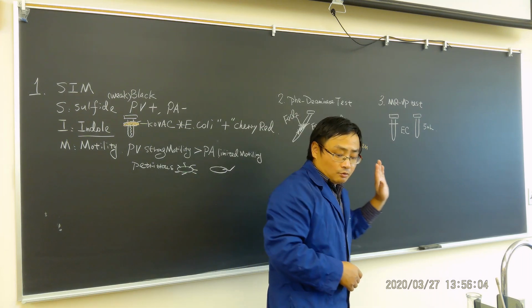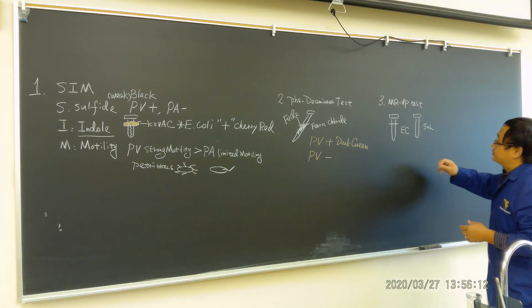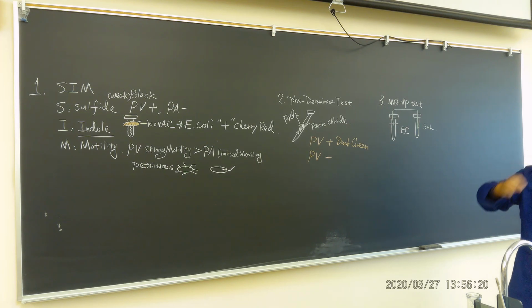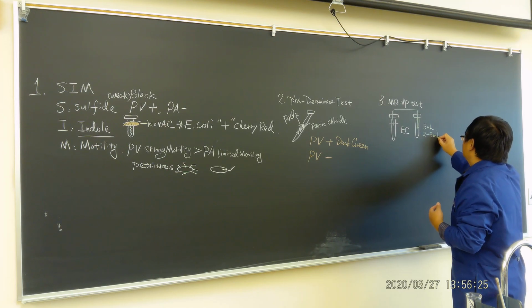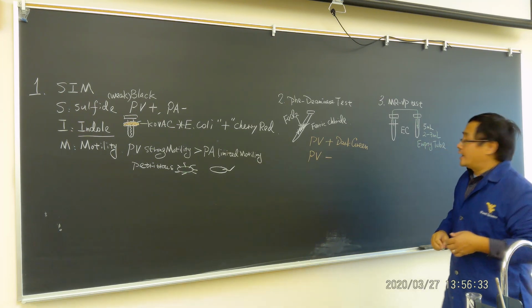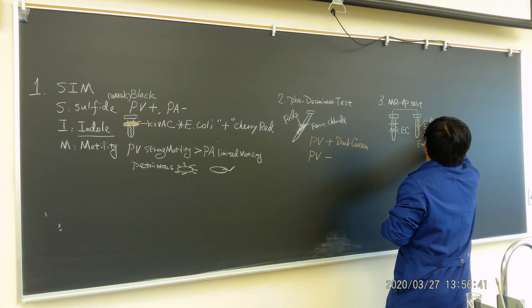So what are we going to do? You're not going to see anything there, because it's just growing. What I want you to do is, let's say this is an E. coli solution. You just add a little bit. We don't use pipettes or anything. You just dump about 2 to 3 ml into an empty tube. And you mark the original tube as MR and the new tube as VP.